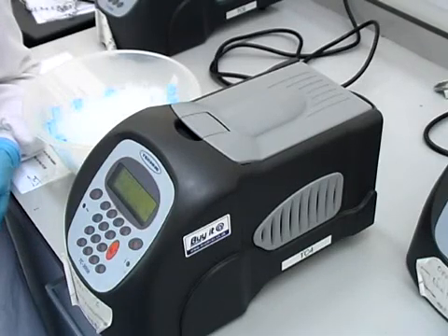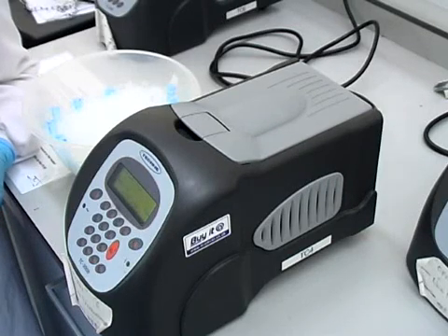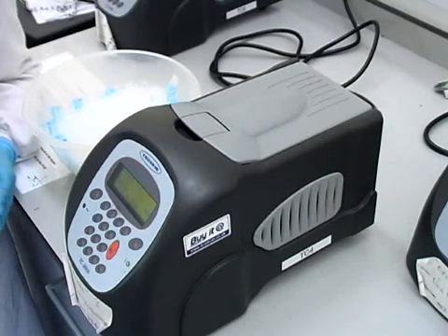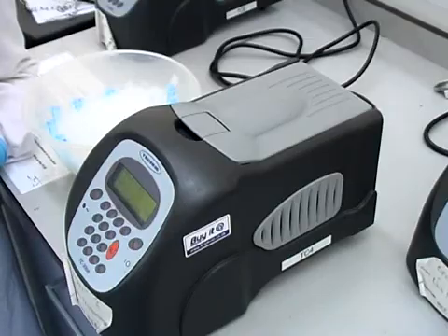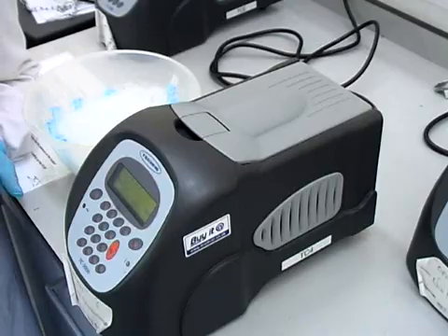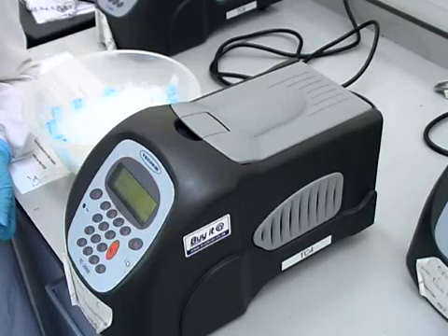The cycler heats again to 72 degrees C where the DNA polymerase amplifies the DNA. And then it is heated again to 95 degrees to denature the double-stranded DNA. This takes place over 30 cycles and the final extension is at 72 degrees C for five minutes.